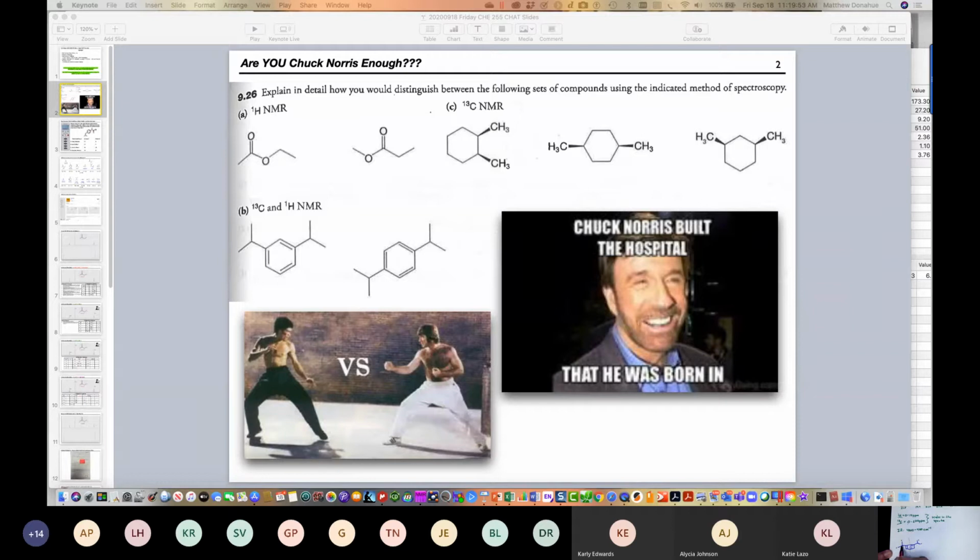Then we have a methine and a methine, so maybe I'll put a little square. Those mirror each other. Then as we move in, we hit this sp2 hybridized carbon. That's different. CH3, CH, this has no hydrogen, so I'll put a little triangle. So we're up to 3 now. Then let me go this way. I converge onto the mirror plane, so maybe I'll put a little rhombus. So 1, 2, 3, we're up to 4.